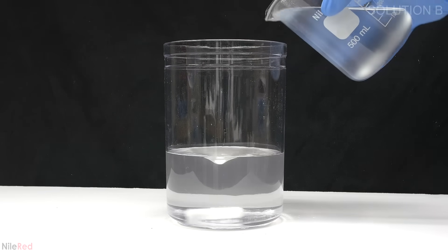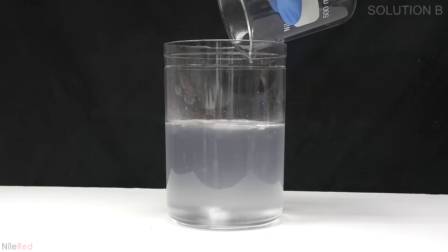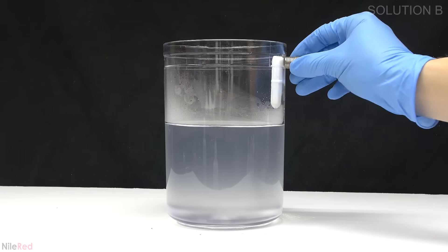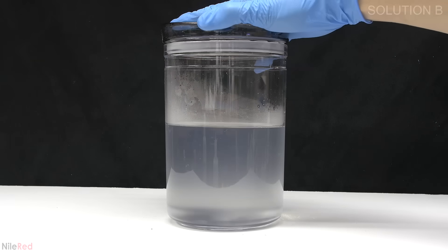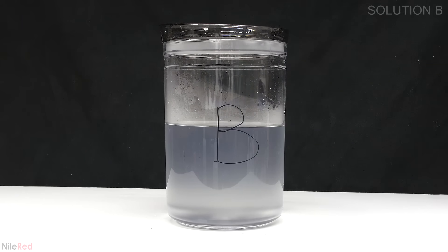Once everything has more or less dissolved I add the starch solution from before. I stir the solution for a few minutes to make sure that it's mixed really well and then I take out the stir bar using a magnet. I label the lid and the container with the letter B and I move on to making solution C.